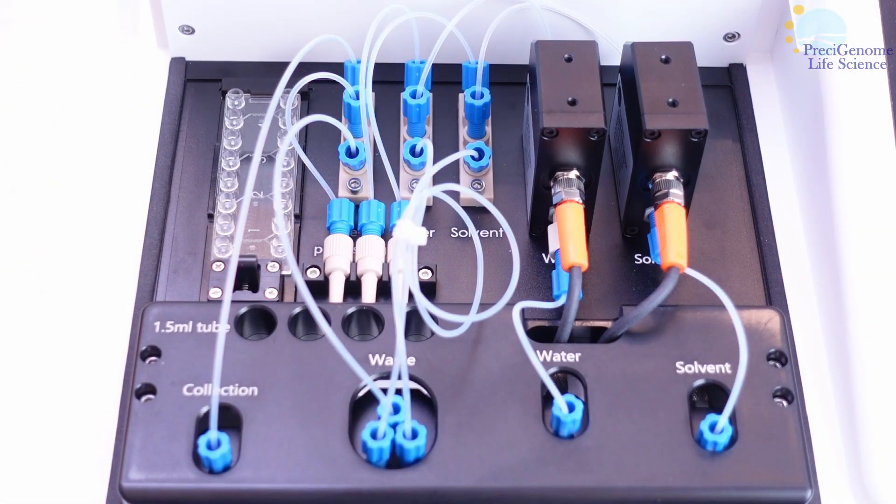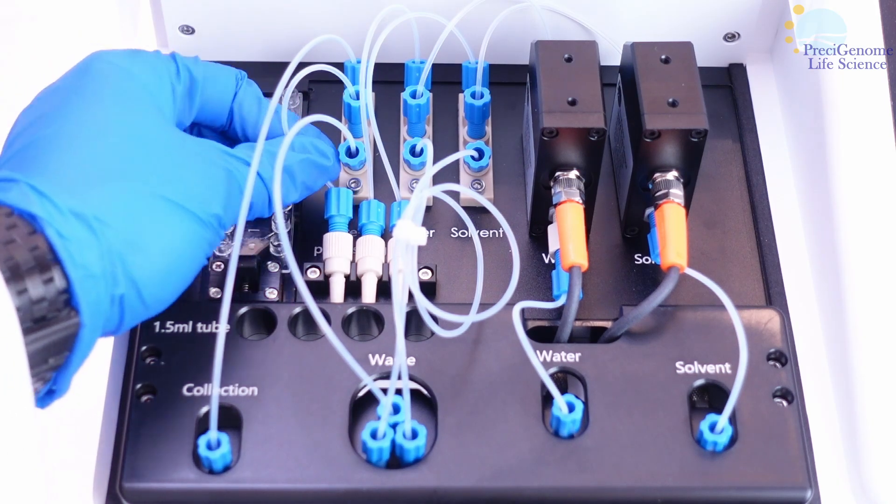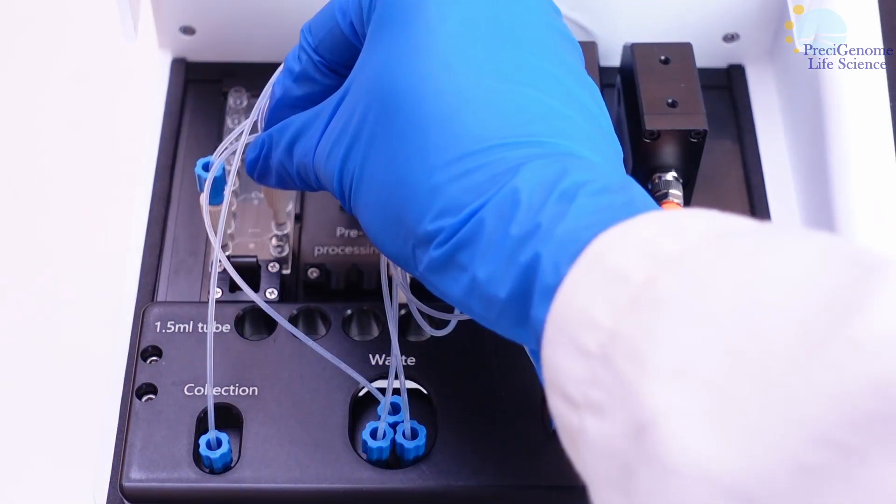The liquid tubing for each reservoir comes pre-assembled, so simply connect it to the desired chip channel. The collection tubing goes on the left, and the reagent tubing on the right.